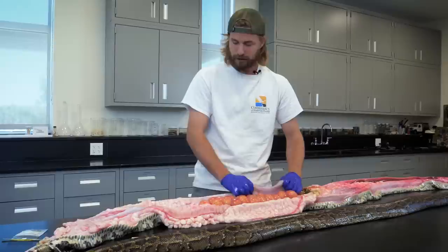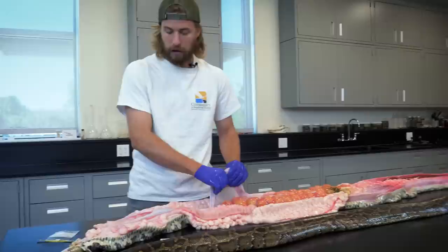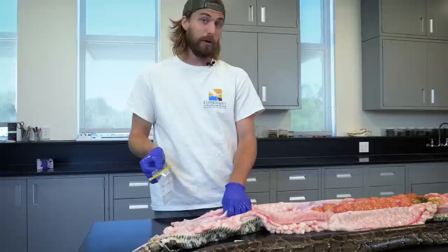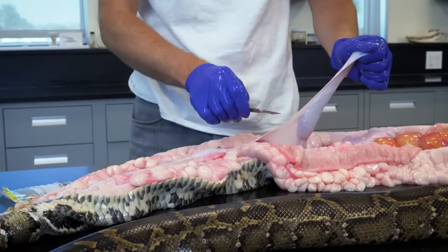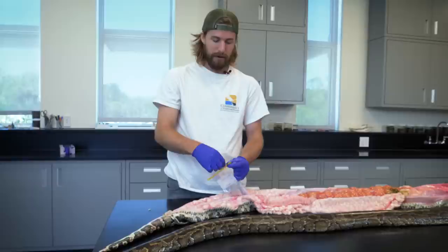Last but not least is the intestinal tract. Like most carnivores, they have really short intestines. What we're going to do now is squeeze all the contents to the end, cut it open, and squeeze it into a bag called a Whirl Pack. We're going to send it off to the University of Florida so they can identify the hair or any other remnants inside the intestines. You don't find a lot of bones — most of what you find are hair and feathers, because they're made of keratin, the same material your fingernails are made of. That stuff doesn't digest very well, and these are the types of things we can use to identify what pythons are eating out in the ecosystem.